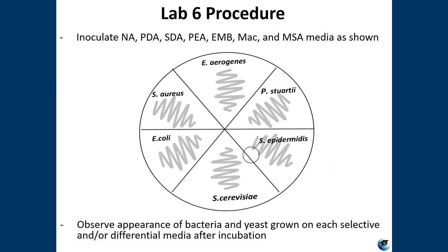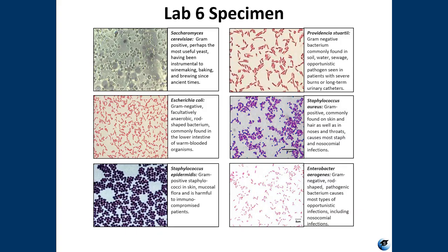Don't worry, I'll walk you through it. I've got it down pat to where it's really efficient and everything's going to be fine. And then all of those plates are going to be incubated, and when we come back, we're going to observe the appearance of all the bacteria and yeast grown on these plates. These are all 6 of the species and some of their characteristics.